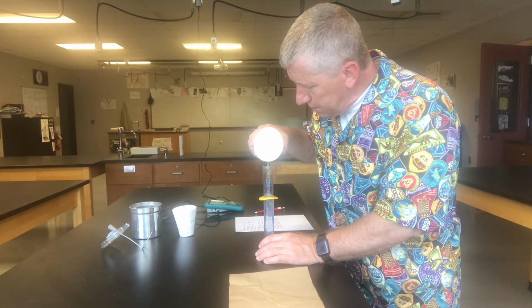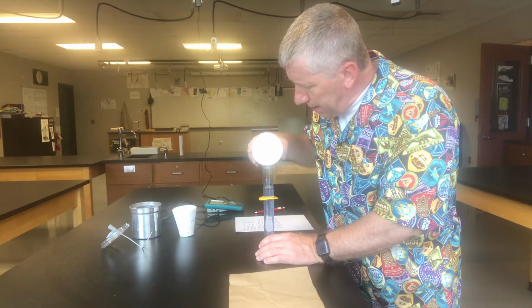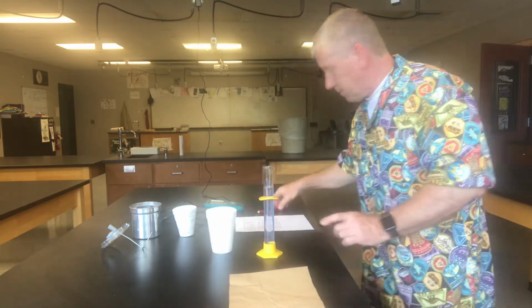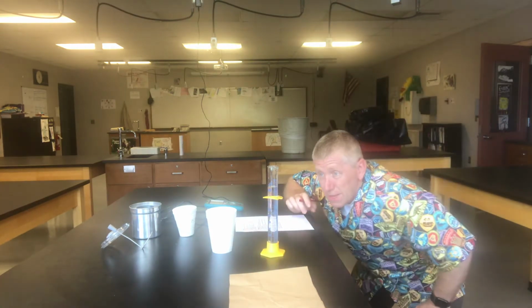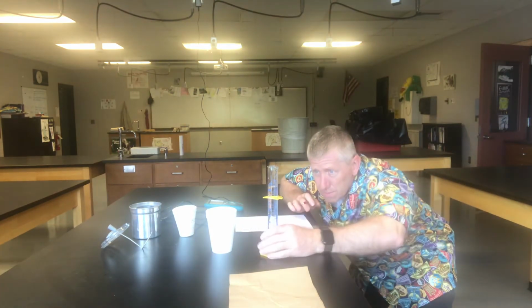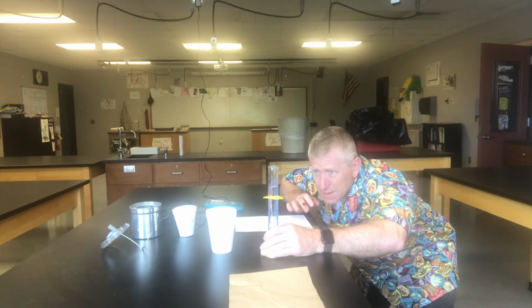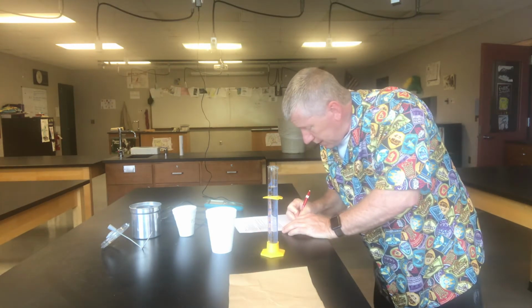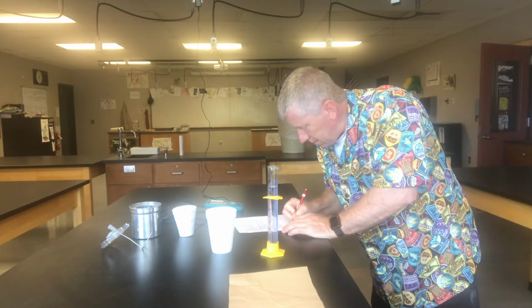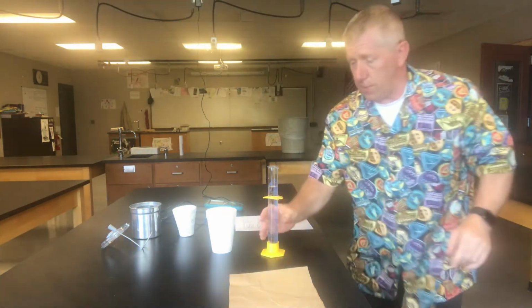Shaky hands. Okay, I'm just going to stop there and record this number and write it down. Let's see, that meniscus is bad, Larry. It's 97.8. I'm going 97.8, lab partner. So I'm writing that down, 97.8 milliliters, okay? So I'm going to get rid of this.